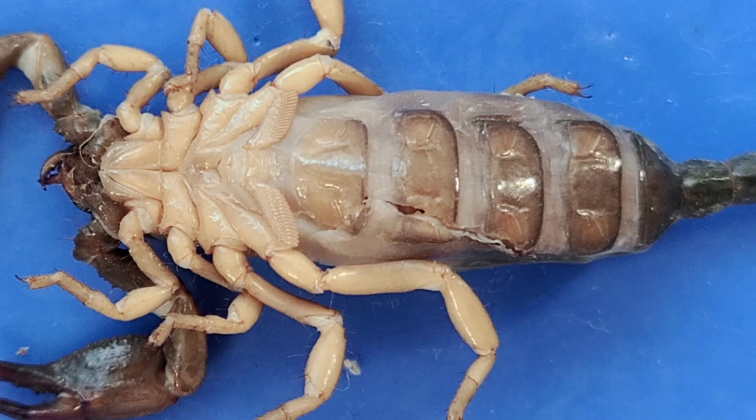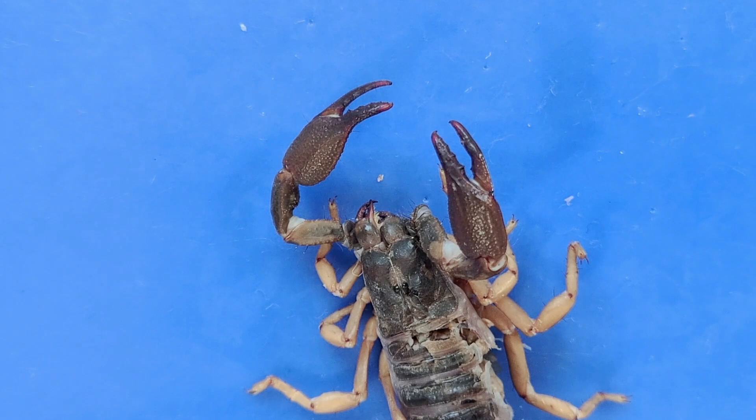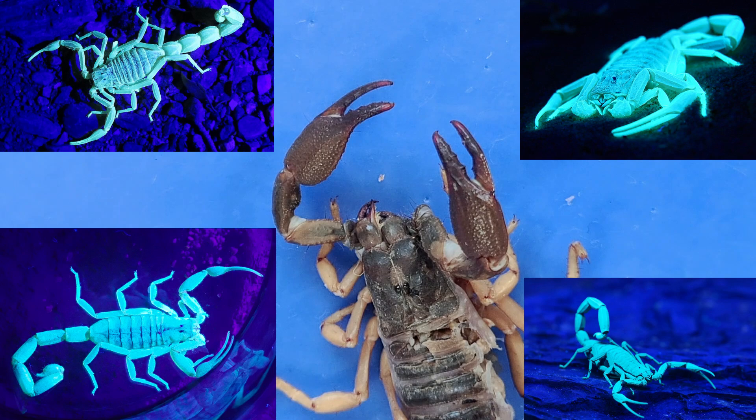Most preserved scorpions are too small to be able to see the internal anatomy without a dissecting microscope, so we'll have to stop at the external anatomy for this one. That's the end of the scorpion dissection — thanks for staying. Here's a fun fact to send you on your way: all scorpions glow fluorescent green under ultraviolet light, such as an electric blacklight or natural moonlight. This is a really easy way to spot scorpions in the dark.